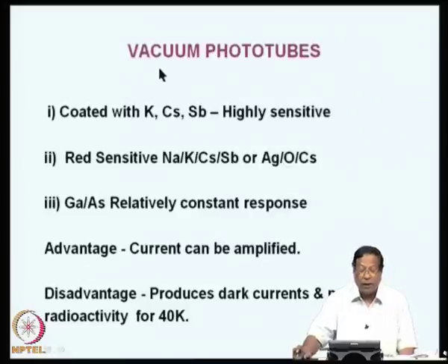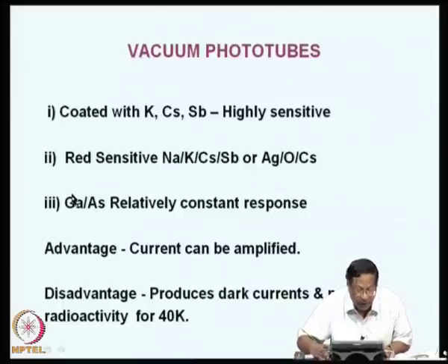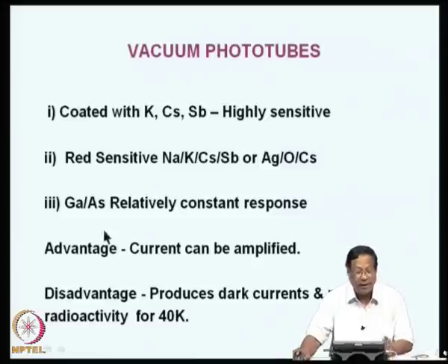So, the vacuum phototubes' cathodes are coated with potassium, cesium, antimony, etcetera. These are very highly sensitive for collection of the released electrons when the light falls on them. Red sensitive sodium, potassium, cesium, antimony are also used, or silver, and then oxides, silver, cesium, etcetera are also used for coating. Now, the other recently introduced materials include gallium arsenide. This gives relatively constant response.